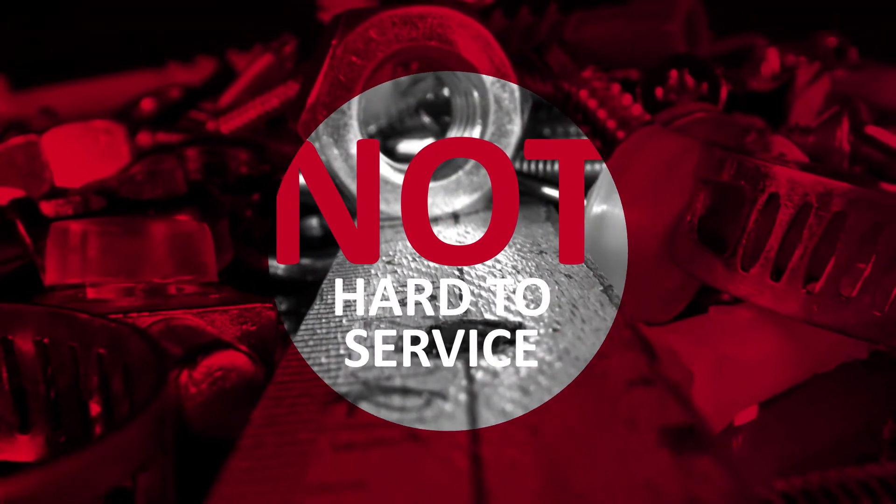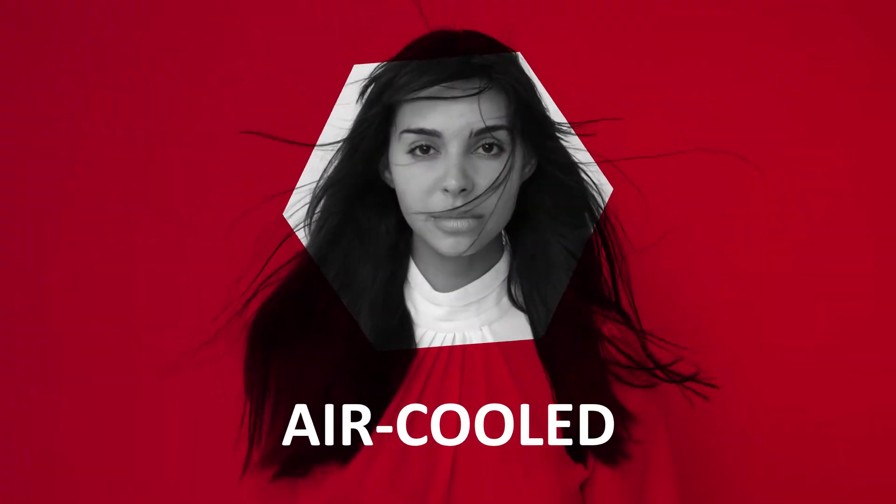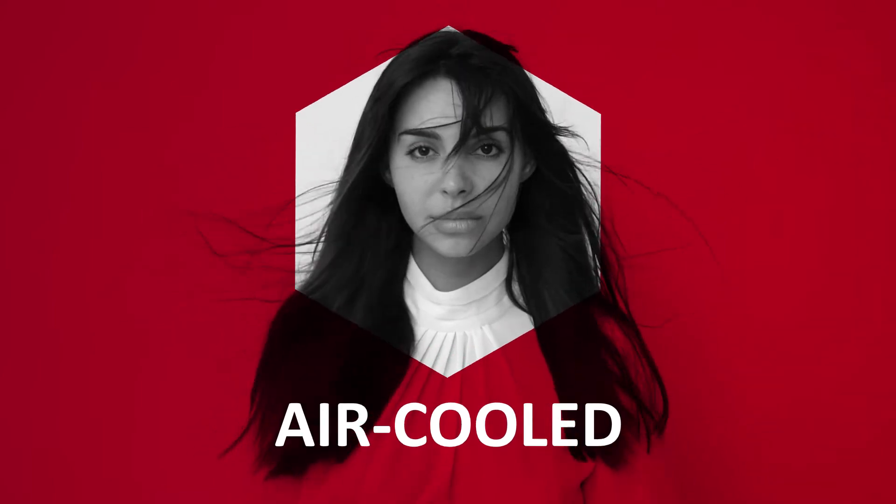That's right, the E2S is not hard to service. And because it is air-cooled, it is also not hard to install. No need for water cooling pipes or other accessories.